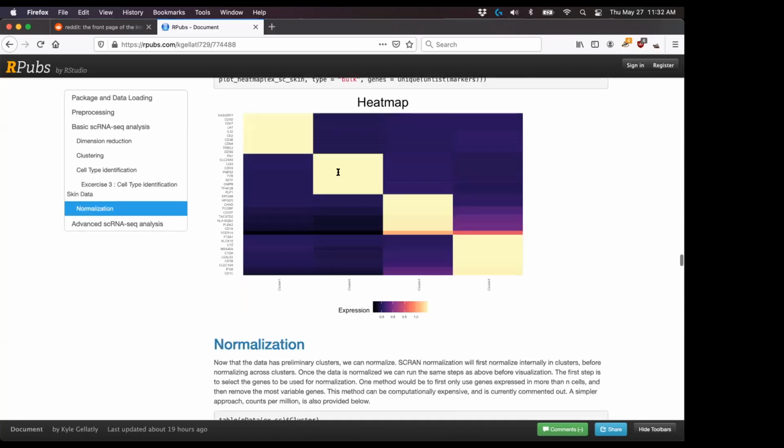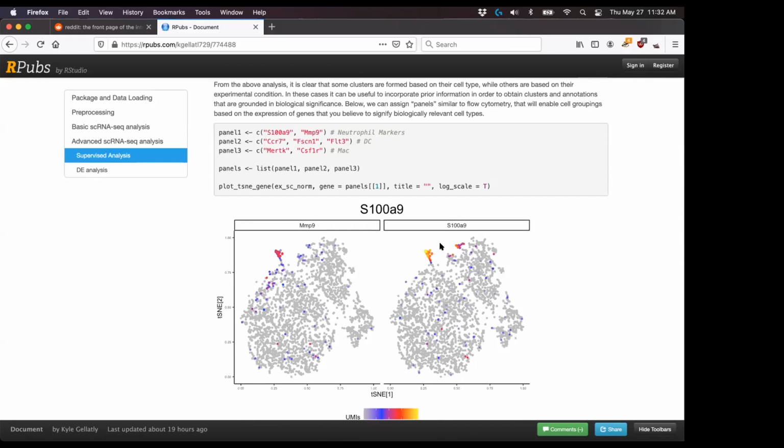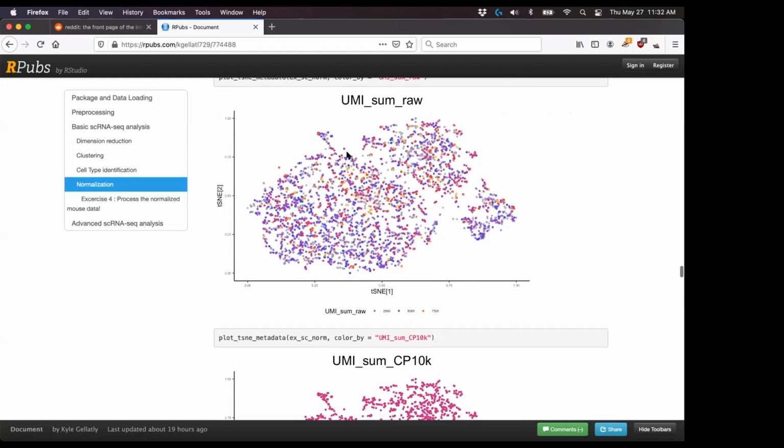So when you go to run your differential expression, most of the time you're going to ask, what's changing about this particular cell type? And so if your clustering is capturing differences in the disease state, it can get a little tricky to ground yourself in cell types first and then run your DE. So this is one approach.